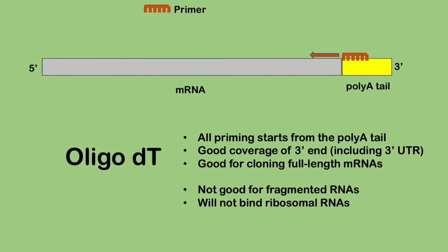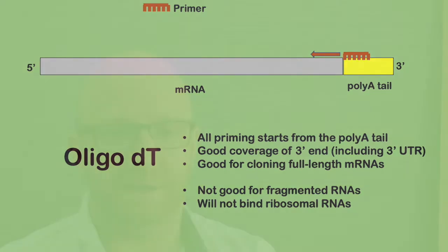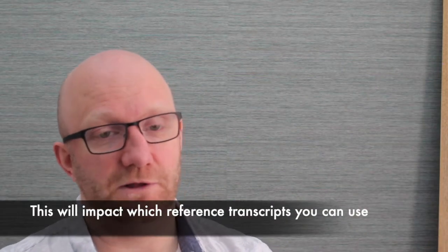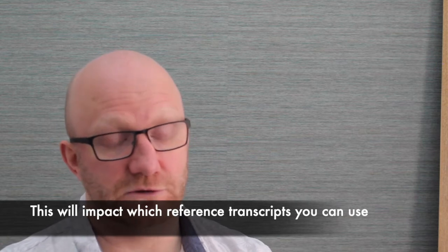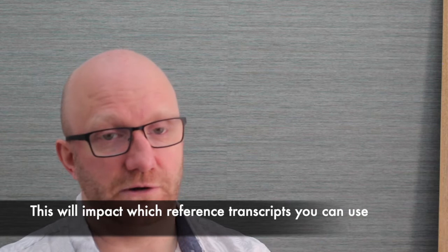However, there are limitations. Firstly, and most importantly, obviously, you will amplify only polyadenylated species, which means that you won't be amplifying ribosomal RNAs, you won't amplify mitochondrial RNAs, and you won't amplify microRNAs. This could be a big deal.